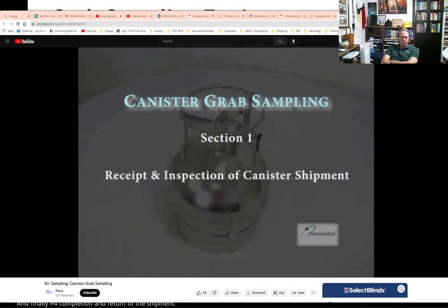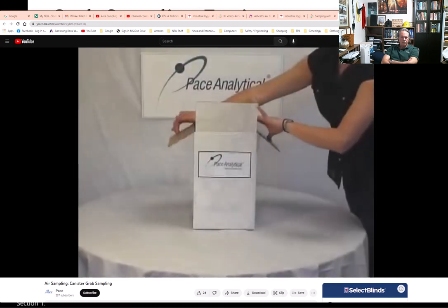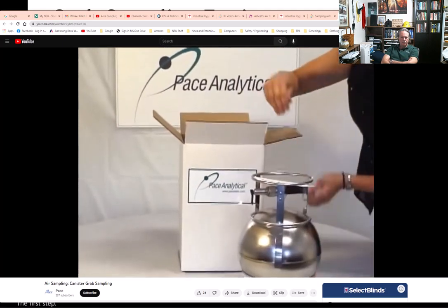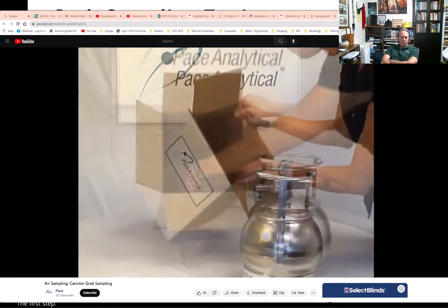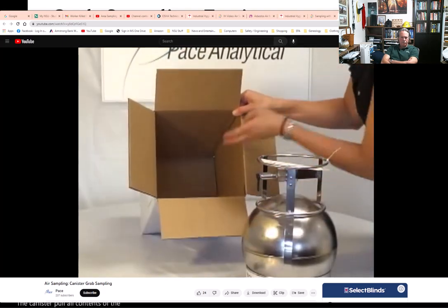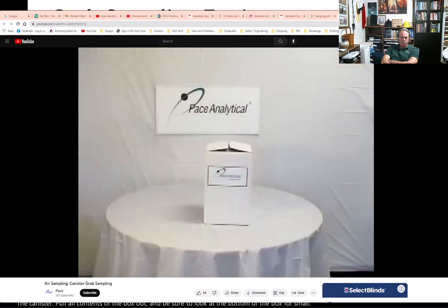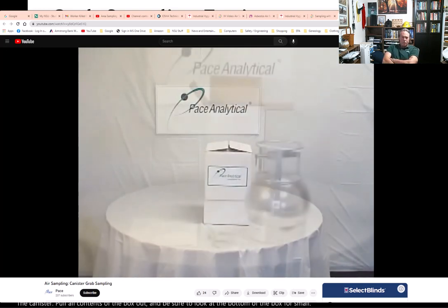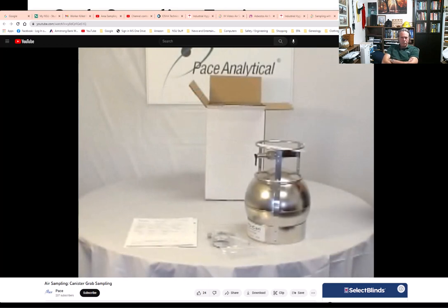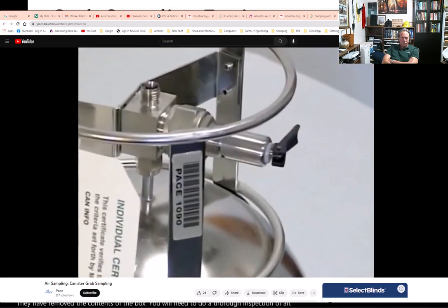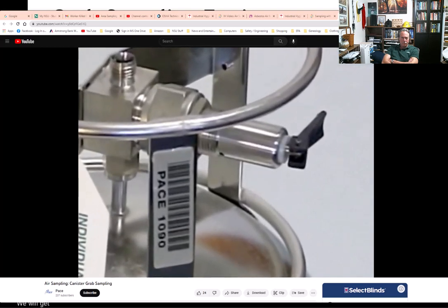Section 1: Receipt and inspection of the canister shipment. The first step is to unpack your box of canister sampling equipment. Simply open the box, retrieve the canister, pull all contents out, and be sure to look at the bottom of the box for small pieces of media and paperwork. Save the box for the return shipment. Now do a thorough inspection of all parts received. Please do not attempt to open the valve on the canister until you are ready to sample.